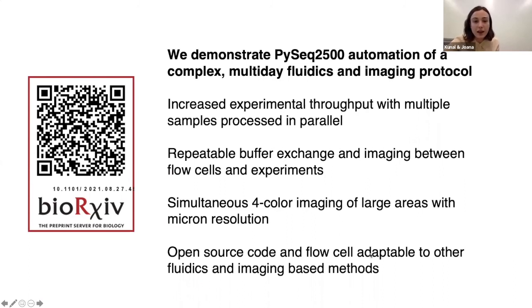And then lastly, we're really proud that this is done with an open source code base and a flow cell design that we think is adaptable to other fluidics and imaging based methods. And as Kunal mentioned, we're already working to make sure that other groups can implement both 4i and other methods on the HiSeq system in their own labs.